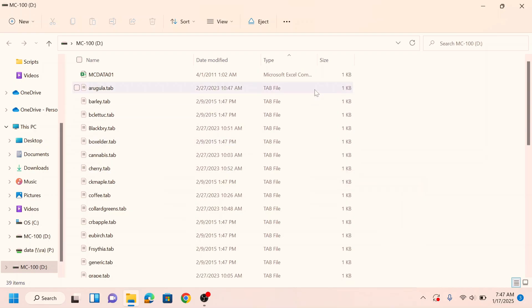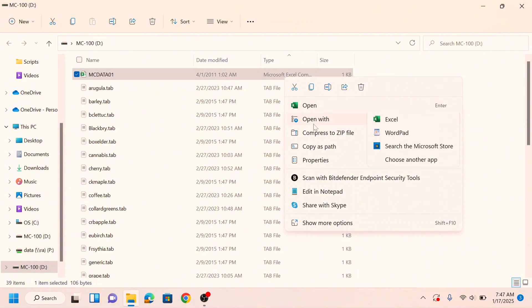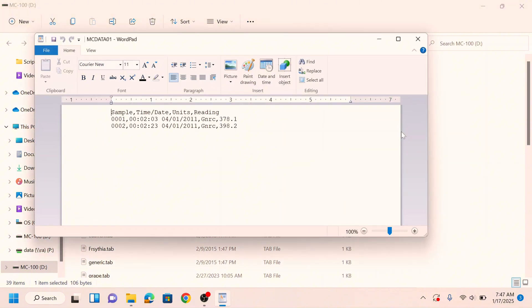When it pops up you'll see a big list of files — these are the species profiles. You'll see a bunch of tab files, which are all the species files; if you ever need to add more crops to your meter, you just copy those files onto the device. One file will be different from the others: a CSV file. You can open it in Excel, WordPad, or whatever spreadsheet program you prefer. It'll be in comma-separated value format, telling you the sample number, time, date, the profile used (such as chard or lettuce), and the chlorophyll reading in whatever units you measured — SPAD or CCI. You can copy this data into your analysis program of choice and start your research.